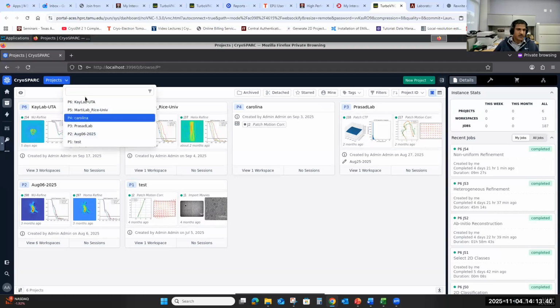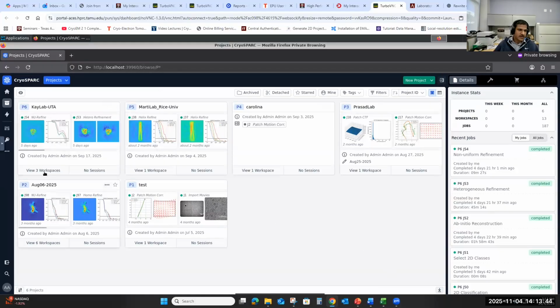If you go here, you can see, if you want to go to a particular project, you can select it here. It will directly go over there. Or you can select any of the projects from this list. It will also bring you over there. So how to create a new project?